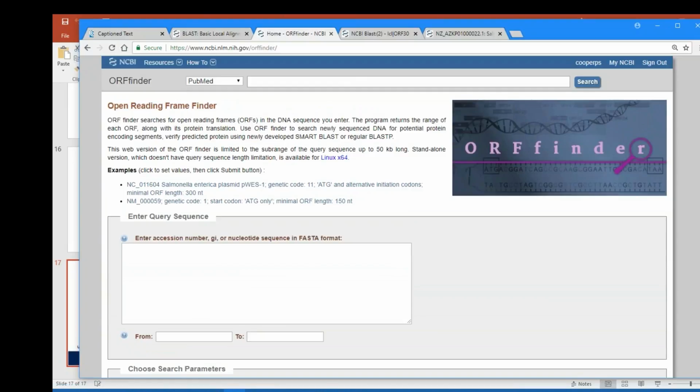There's another question that somebody had, which is he's interested in IPGs, but he wants to know if you can filter the IPG clusters shown to those that have specific sets of organisms. And he's interested in EDirect or scripting. Can you filter the IPG hits that are returned to those that only have a certain group of organisms? So I think, if I understand the question, yes, you can.